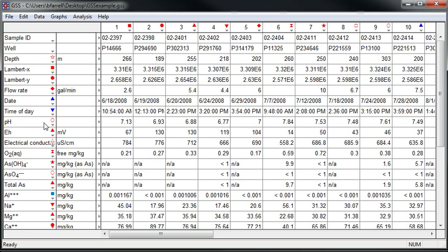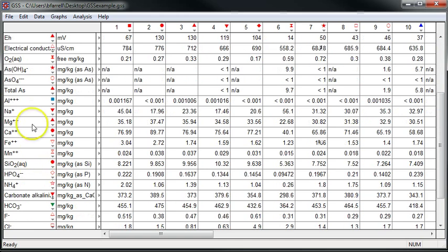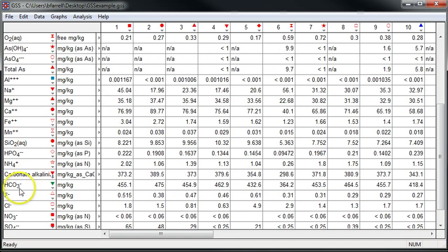Among the analytes I have measurements for are pH, sodium, magnesium, and calcium, bicarbonate, chloride, and sulfate.